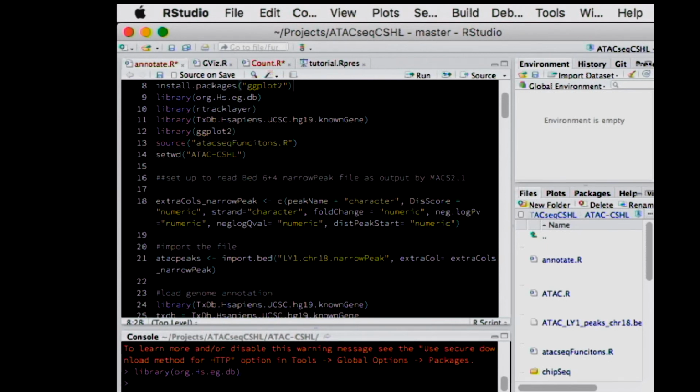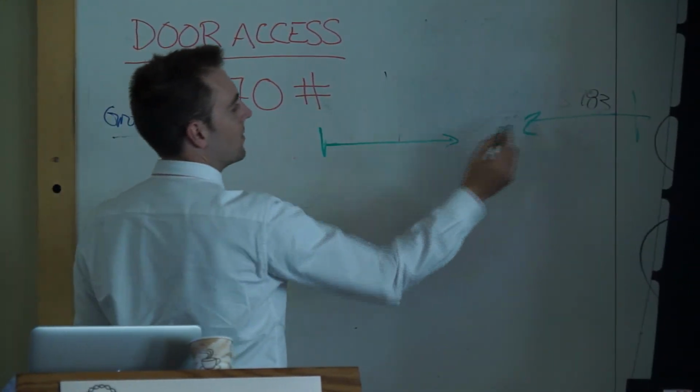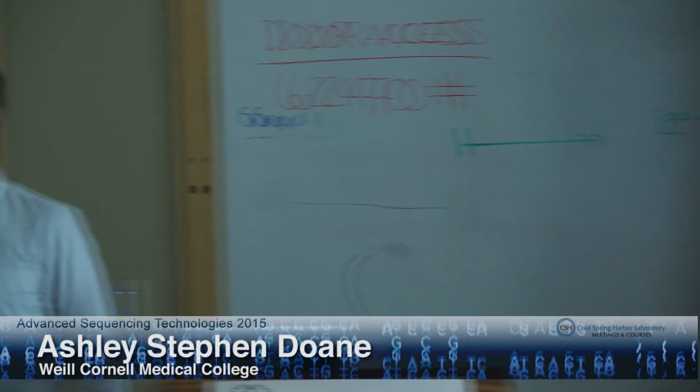And so often there'll be sort of something, but can I erase it? So we're going to have a pair. Hard to see. There'll be sort of an insert in the middle, right? It's like RNA-seq, and between the two pairs. So that in total will represent sort of our fragment length, as we call it.